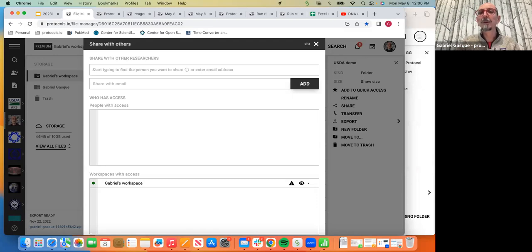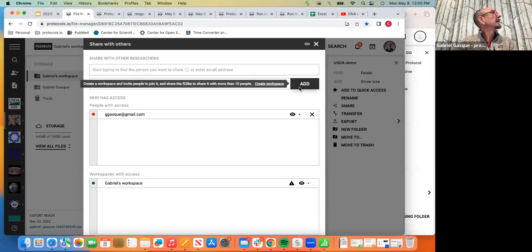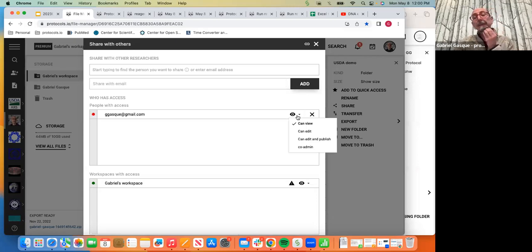Did I answer your question, Marlena? So if I share my folder, and I add, you can control what this collaborator can do with those documents.